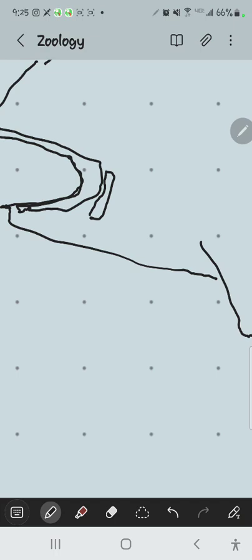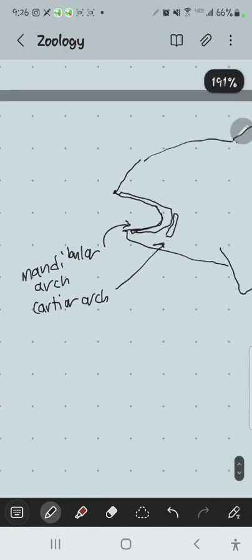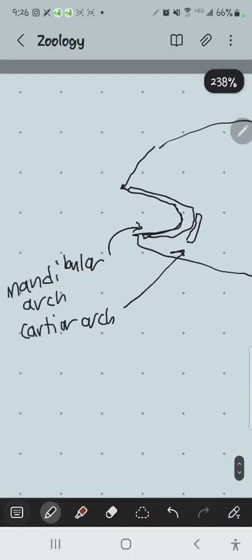But, and I'll tell you what label A is here in a second, what they need is a support frame. And this is kind of like a bicycle frame. You know how bicycle frames have the front triangle and the back triangle, and the two triangles work together to make the bicycle frame. That's what the shark jaw is. It's a combination of different structures.